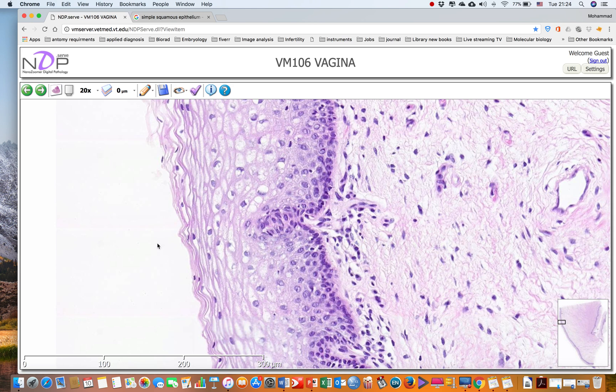At this area, we could not find the stratum corneum or stratum disjunctum.